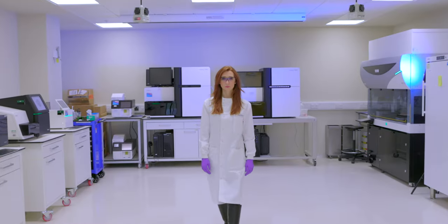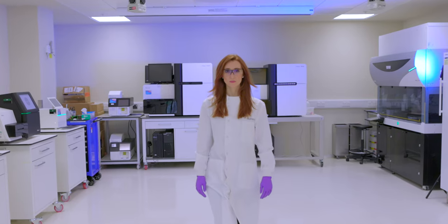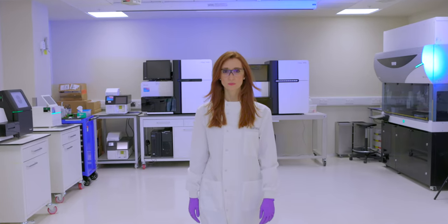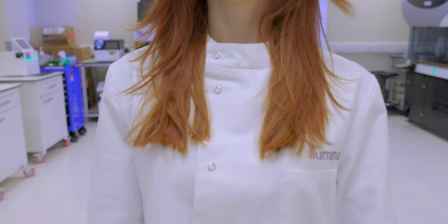In this video we will show you how to set up a run on the Illumina MySeq system upgraded to Microsoft Windows 10 and the MySeq control software v4.